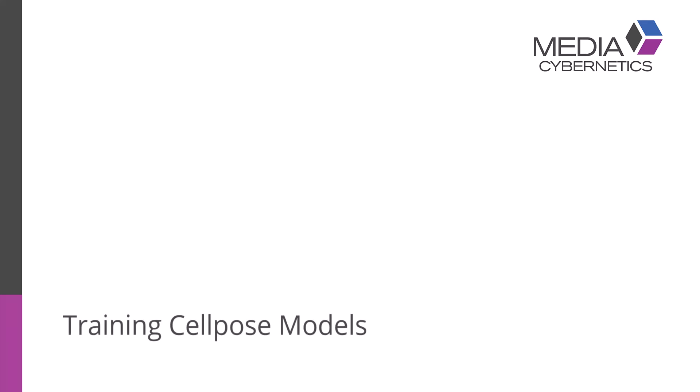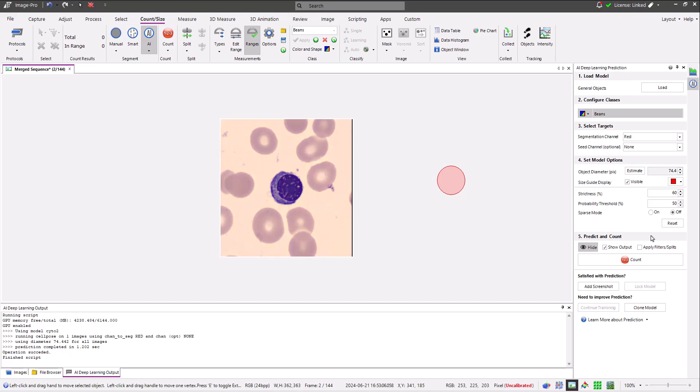In this video I'm going to describe how to train a cell pose model to find a specific class of objects.